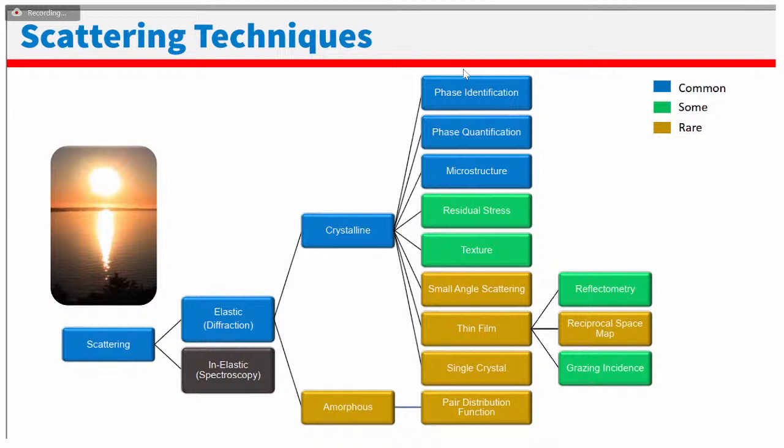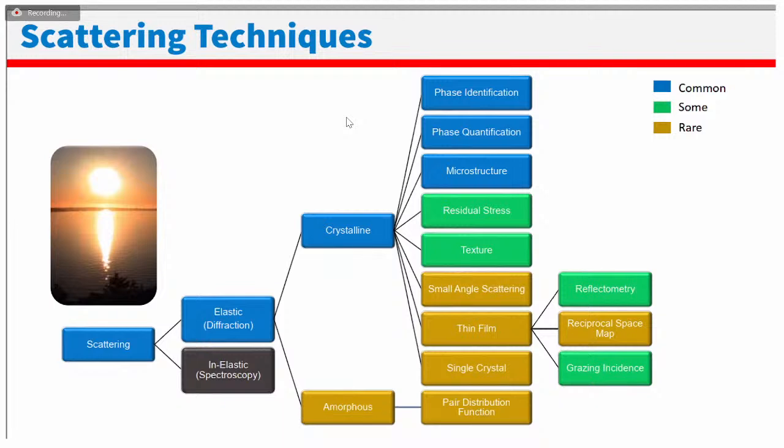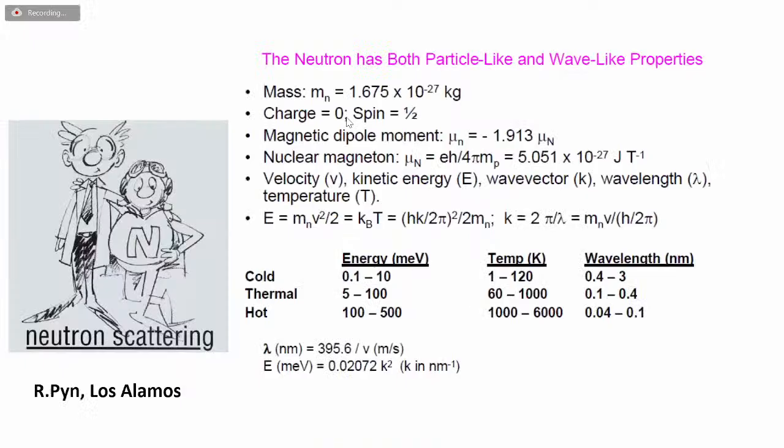So we observe many kinds of crystal structure during phase transformation in situ, and depending on whether you want to observe the surface or the inside. The dynamics is mostly about what the atoms are doing when we give energy. Sometimes, for example phonons, we have to do inelastic scattering.